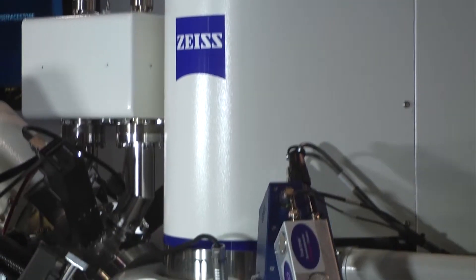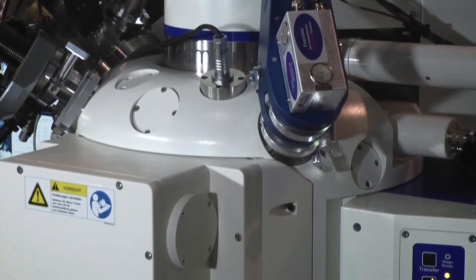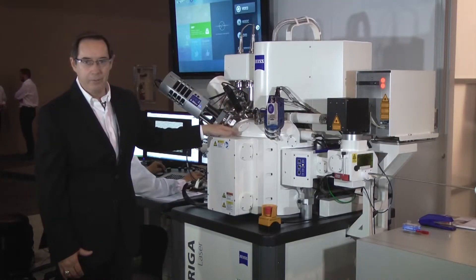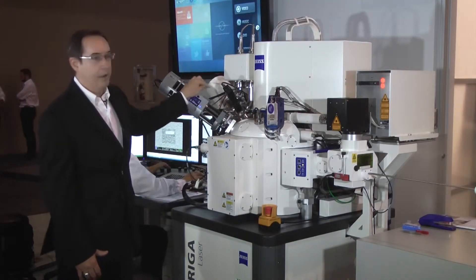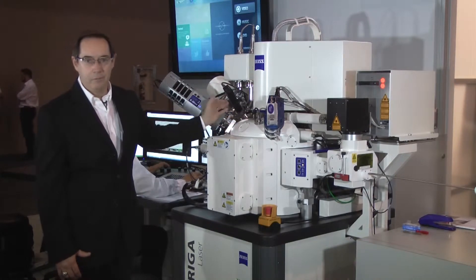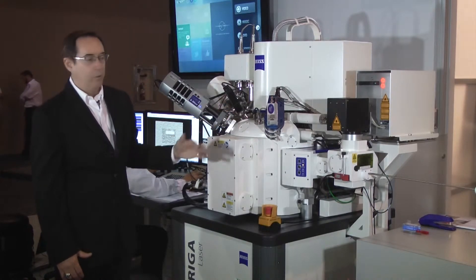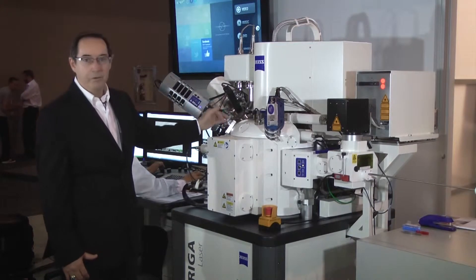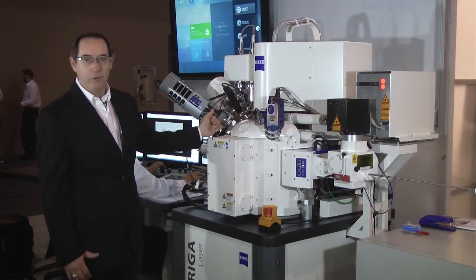This large chamber here is where our specimens go. What we're able to do with this FIB-SEM is to image these samples with the SEM and modify them with the focused ion beam. Now what we've found after having this for more than 10 years is we want to modify or remove larger amounts of material.